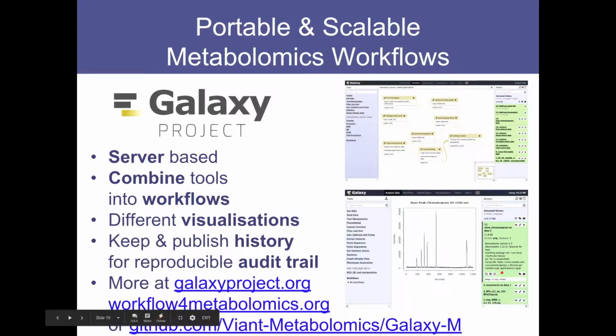And this is used not only in metabolomics, it's coming from the sequence analysis area, and proteomics is using a lot of Galaxy. So it's pretty mainstream by now. You can see more on the Galaxy websites. There is also a dedicated installation for metabolomics from the French workflow for metabolomics team. And also the team from Birmingham has created a flavor of Galaxy that can do metabolomics.